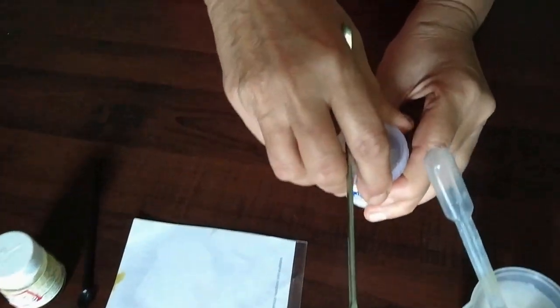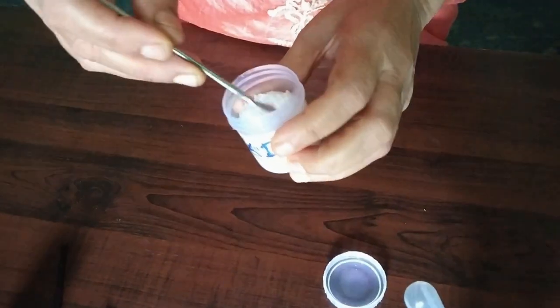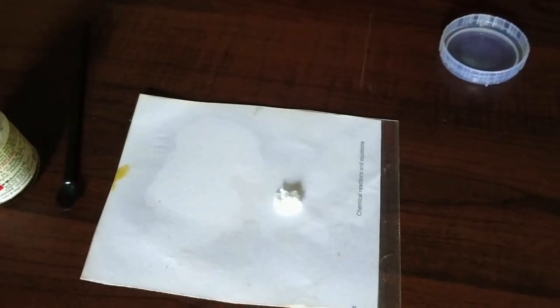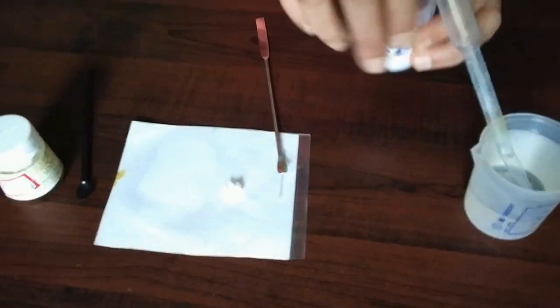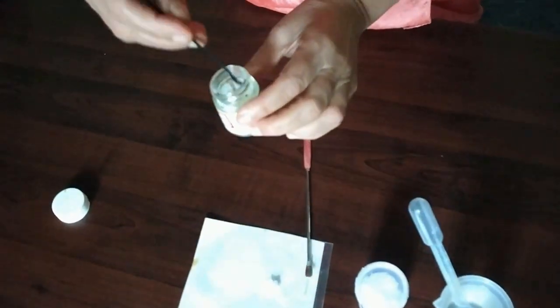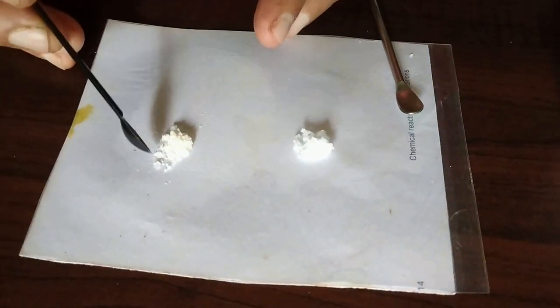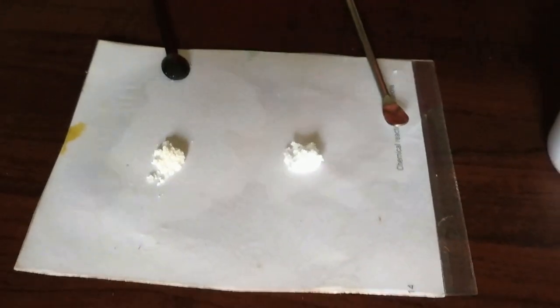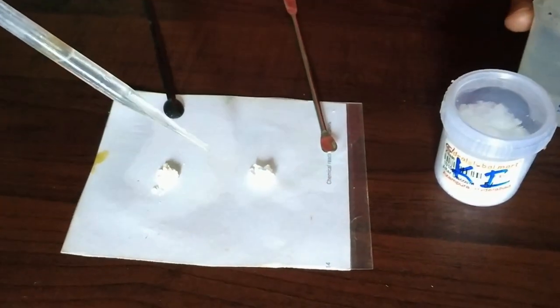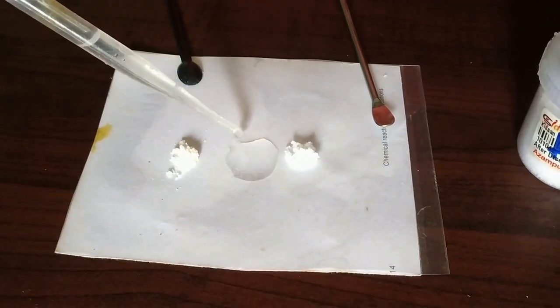So as we have done in the previous one, in the neutralization reaction, here also we are taking the chemicals, a little of it, and putting it on the paper. So here I have just put a little of potassium iodide on one side. Leave the spatula there. And I am taking lead nitrate and just putting a little of it on the paper and leaving the spatula there. Then with the help of a dropper, I'll take water and put a little of water at the center. So much is enough.